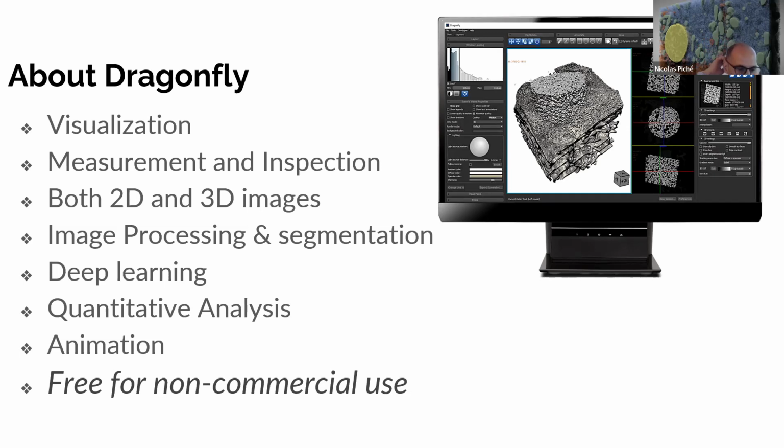So today I will show mostly the basics, up to the segmentation tools, 2D and 3D, that you need to use anyway to provide a data set, a training set for your deep learning or whatever advanced segmentation that you do. So it's important that people see all the capability of the drawing tool. And I will also talk about all the object models that you can deal with.